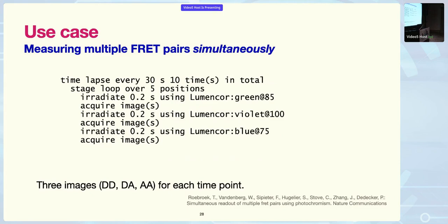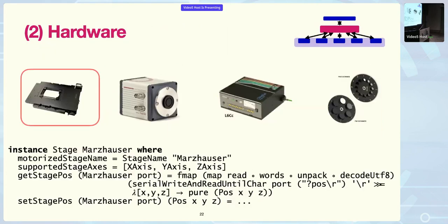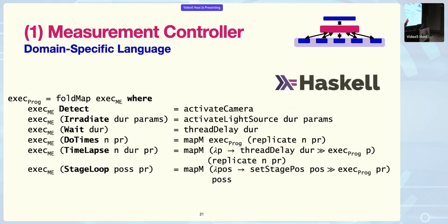Yeah, so maybe I should go. This is not Haskell. This is the program being built with the DSL. This is Haskell. What was difficult, so maybe first I have to explain, we have 3 parties involved here. We have the real domain experts which are using the DSL. And then you have the collaboration between me and my promoter, which are on the computer science part, and the professor of nanobiology, who is in nanobiology. So it was him who first started building this, and in collaboration with us, we started to exploit DSL features and so on. But for him, he was the one who had to learn Haskell.